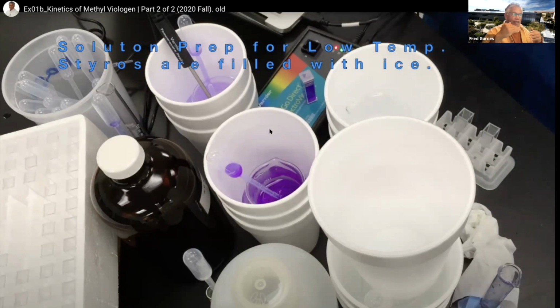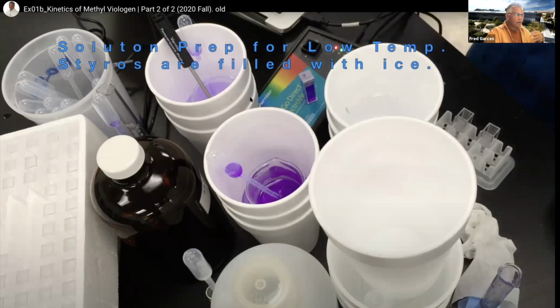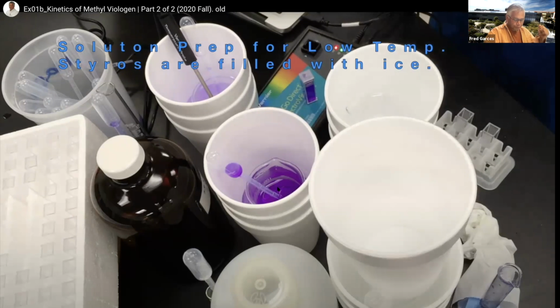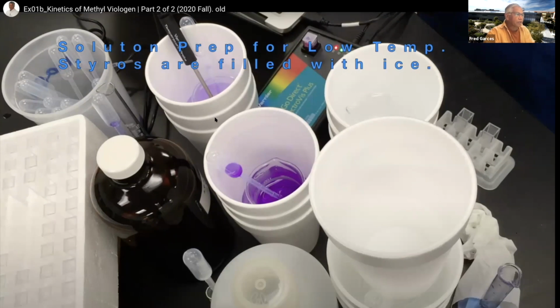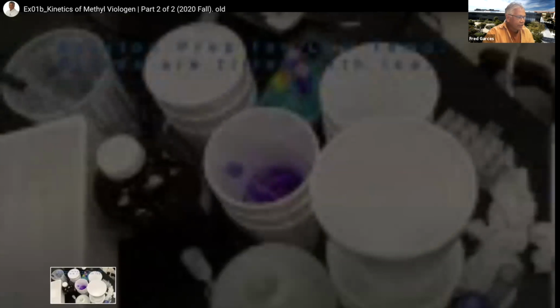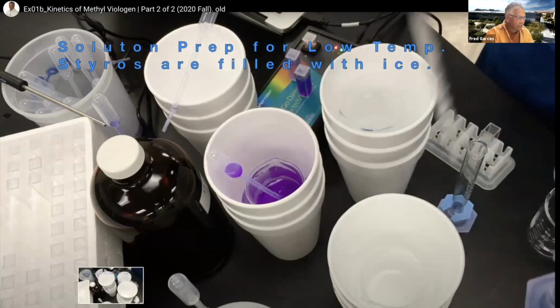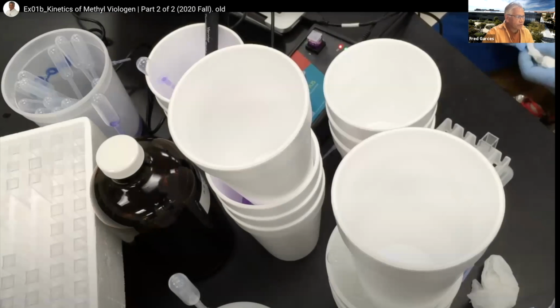try and simulate the temperature, but I can't be putting the temperature probe into the cuvette. Okay, so I just put the temperature probe right here, and hopefully my temperature is constant. That's the hardest part about this experiment. Make sure that that temperature is constant. So again, this is all the prep work just to do that.